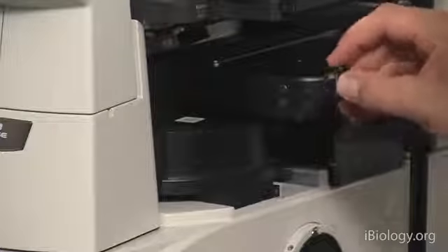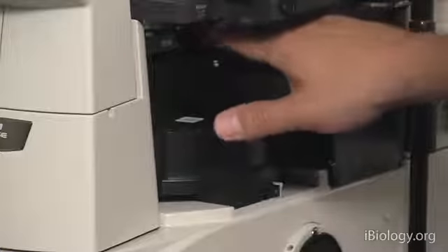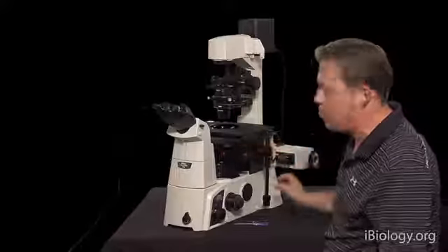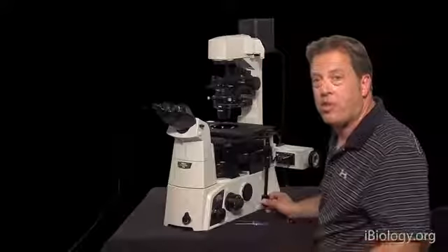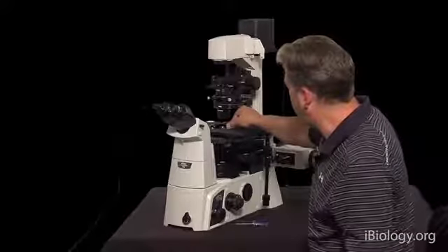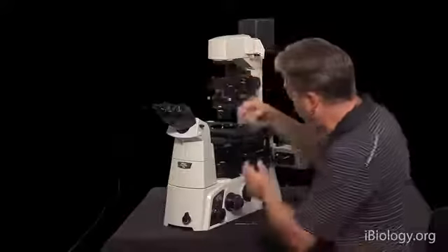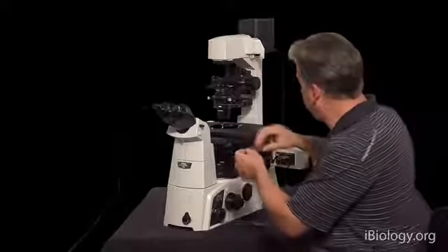And this prism slides into what's called the nose piece, or the objective turret, right underneath the objective lens, like so. So you have one prism here, another prism below the objective, polarized light, and that's really all the components you need for DIC. So once you know that you have extinction, you can put your prisms in place, and now we'll switch specimens to a cheek cell preparation, which will give us a nice specimen to see the DIC working.